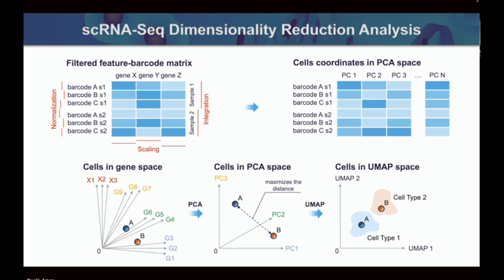So what you want to do is select the genes or the peaks that will be the most informative, and you can select how many you want. If you select few, you would see only the most significant differences, for example, cell types. But if you select more, maybe you will see finer differences, but then you can start messing up your cluster distributions.